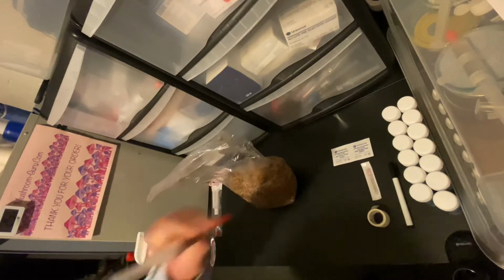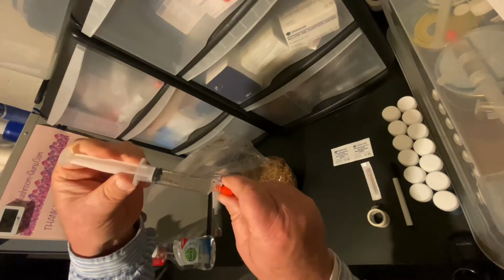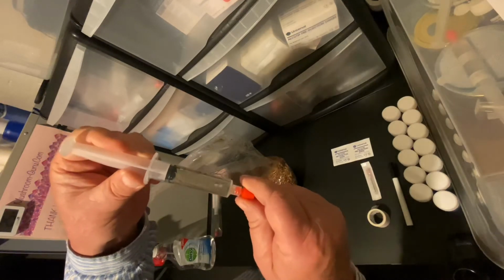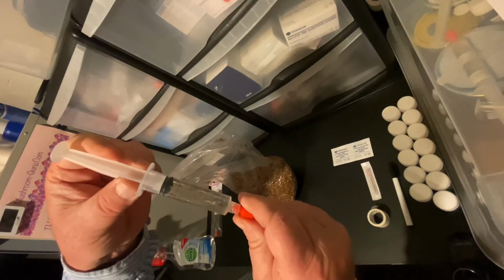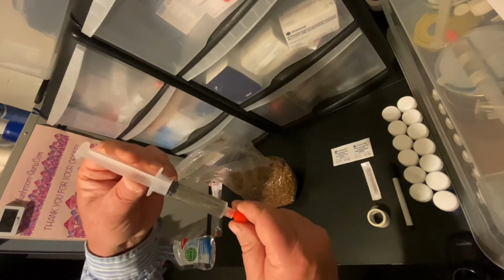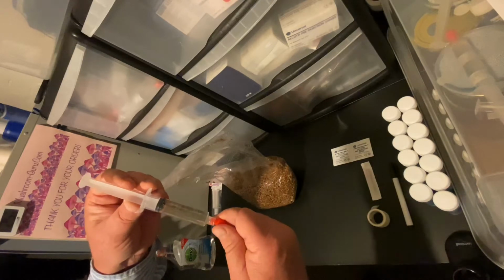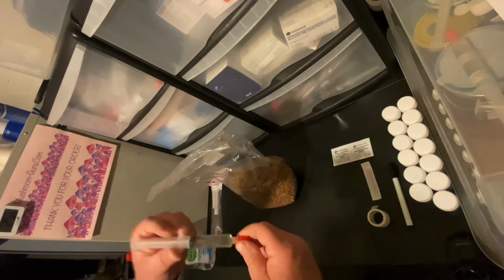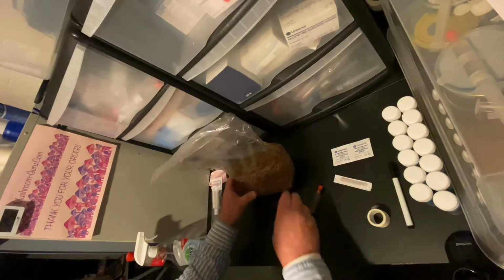Shake it. Yeah, like that. You want to see that it's all nice and spread out, because they tend to clump together. That's what mycelium does. And when you shake it, you spread it out, so it's going to spread in the grain much faster. All right, so ready to inoculate this.